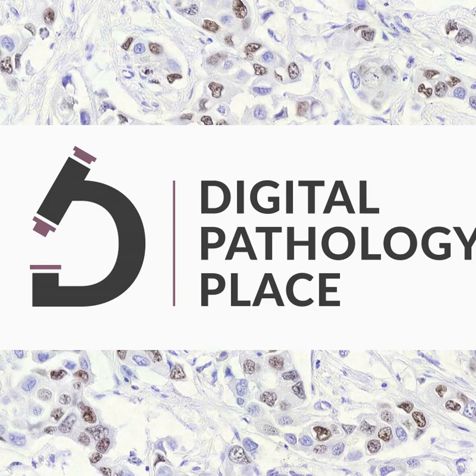And definitely the high dimensional spatial biology approach is a very exploratory approach. So if we are now thinking of cancer, in which indication are certain markers expressed, or if you want to stratify patients or whatever. So if you really want to explore mechanism of action and so on, so when you need the maximum information, then I think that's the tool to go to. And there are also multiple other omic techniques that can join in, and you can combine them to really maximize your information there.